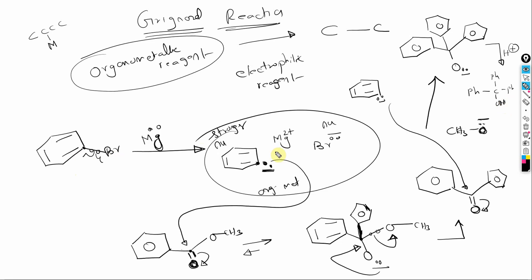So when you take a Grignard, react that with an electrophile such as the one we have here. So this is a co-reactant. You generate the Grignard to get this structure, right? So when the Grignard reacts with the co-reactant, and when you have two equivalents of this species, you get triphenyl methanol. Methanol is CH3OH. You replace each of the hydrogens with the phenyl, you get triphenyl methanol, and this is the compound we are going to make in the Grignard's lab today.